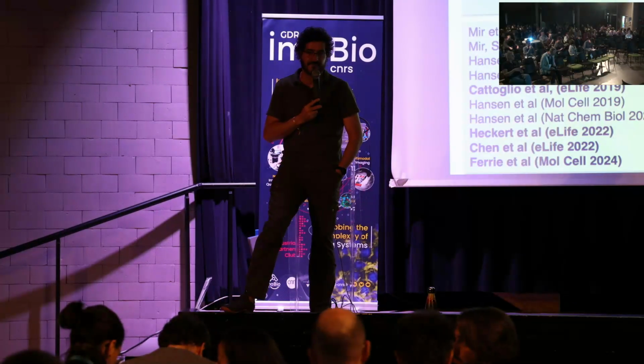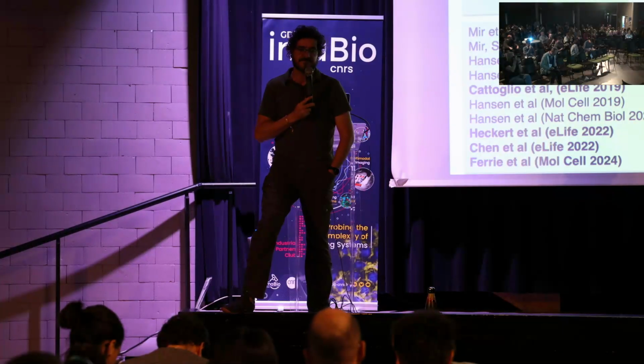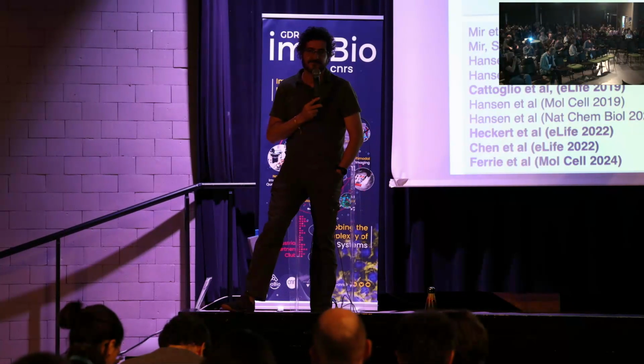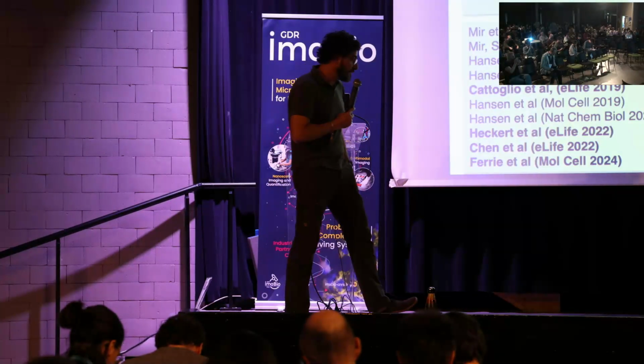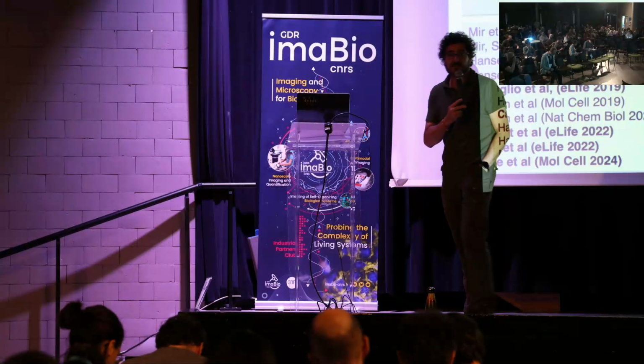I was really fascinated by what you showed with the IDRs changing the on rate of the transcription factors or nuclear factors. And I was curious, what happens if you do the opposite? You add extra IDRs. Do you sequester away all these nuclear factors from the DNA, or can you increase the association? Yeah, this is really the experiment we did with hypoxia-inducing factors, right?